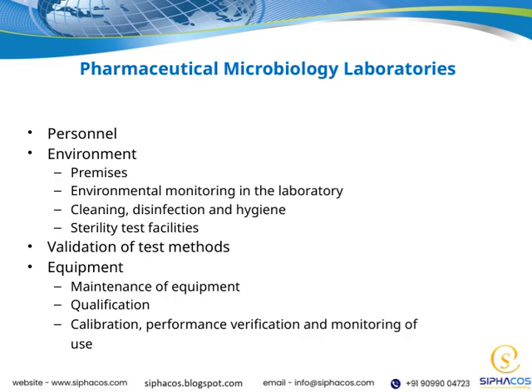Now, let's consider sterility test facilities. These are specially designed areas where we conduct tests to confirm that products are free of microbial contamination. Proper design and control of these facilities are key to obtaining valid results.